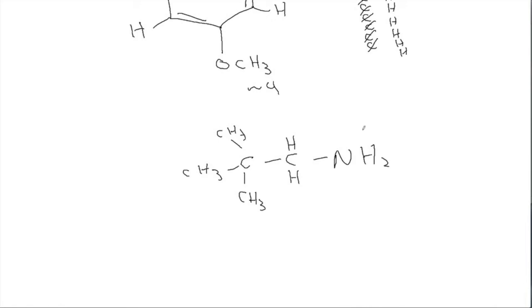Oh, that's an interesting point. Well, I would say that it definitely is the NH2 group. And why is it so far to the right then? I'm not sure. First of all, notice it's pretty close to 1.5. All of these ideas from the tables are not exact, so it's not too far away from 1.5. We'll just have to accept it as close enough. I'm not sure why it's breaking the rule there. Maybe the table is a little bit inaccurate, or maybe this is an unusual spectrum, but this peak at about 1.3 is the NH group.